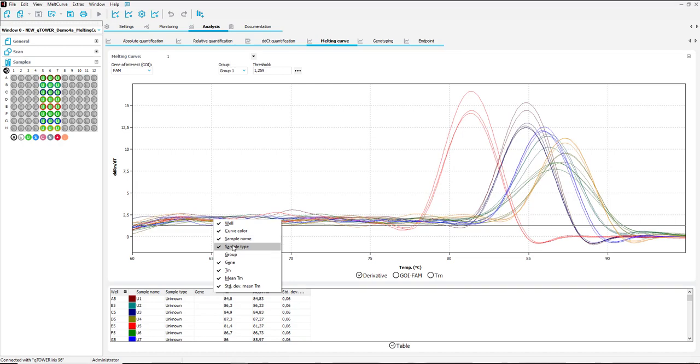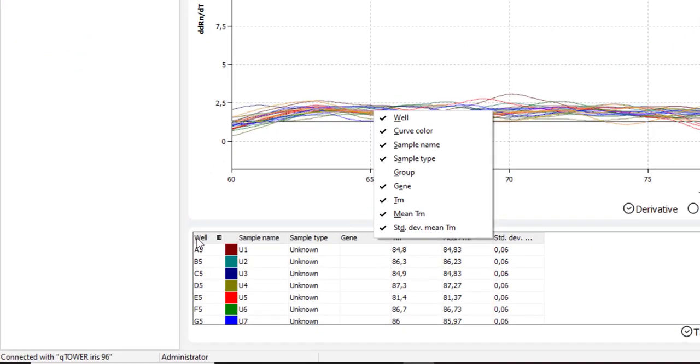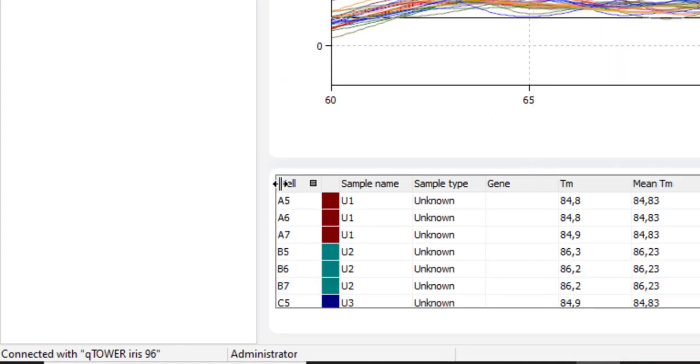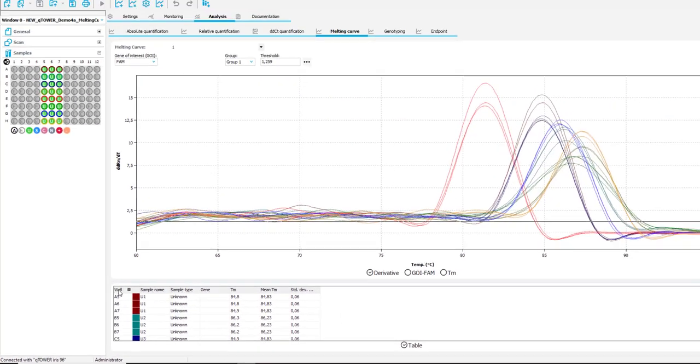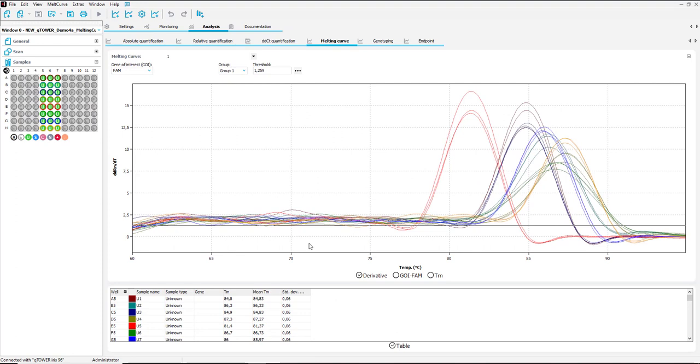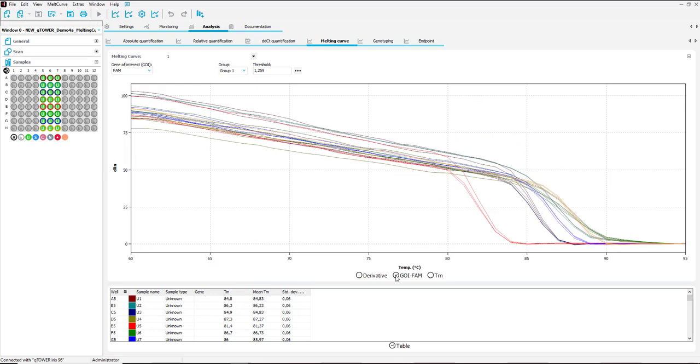By clicking to the well you can change the arrangement of the results from column to row wise and vice versa. In the tabs below you can switch between the different depictions of the melting curves and they will show a graphical representation of the analysis results.